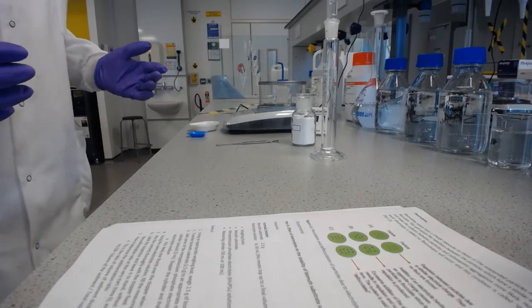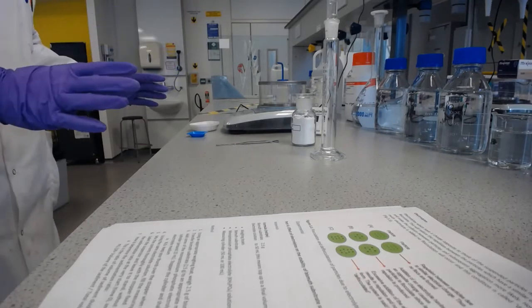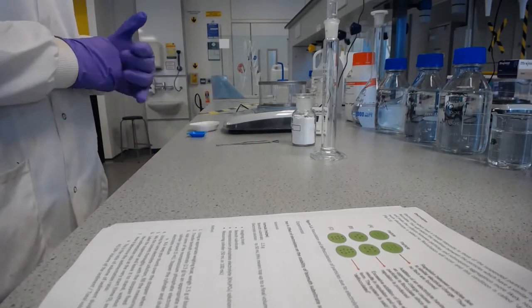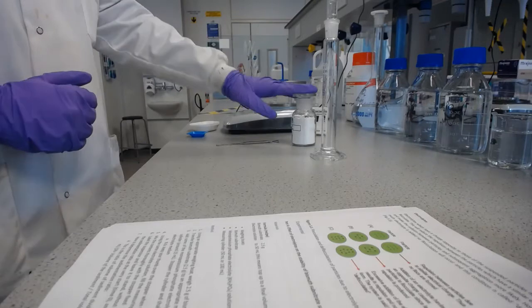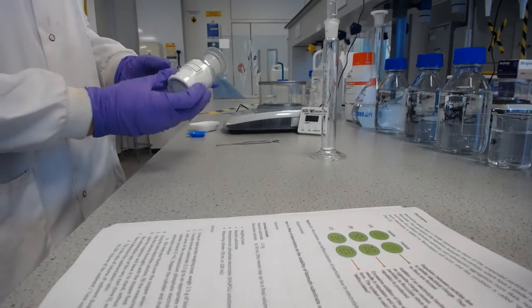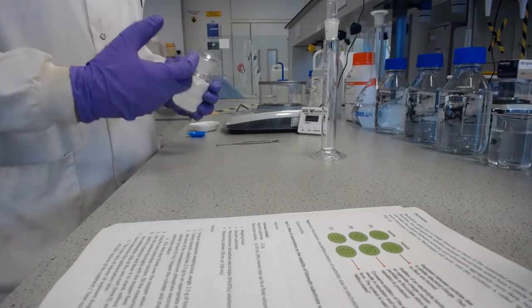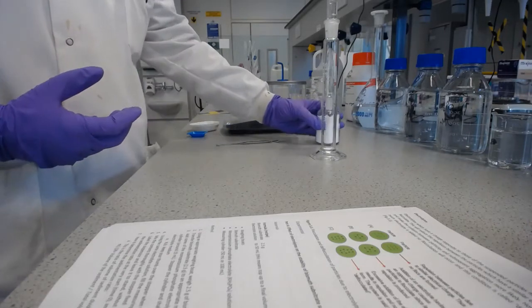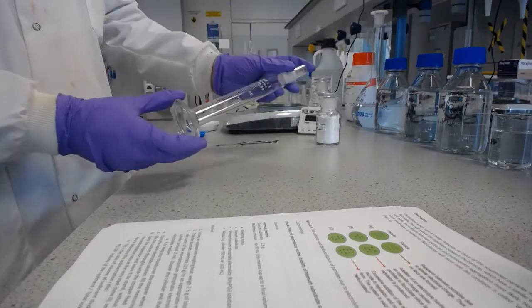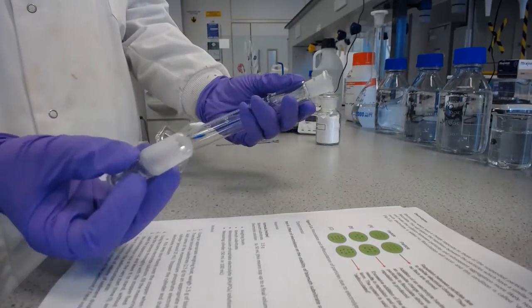Let's get going with part A of today's lab. I've got everything that I need in front of me, and it's actually a really quite straightforward part of the lab. We need simply to have bismuth subnitrate, which is a powder that we have here, and it's already at a set sort of particle size. It's a certain fine powder, and I'm going to need 5 stoppered measuring cylinders. So you can see we have a stopper in the top of these measuring cylinders.